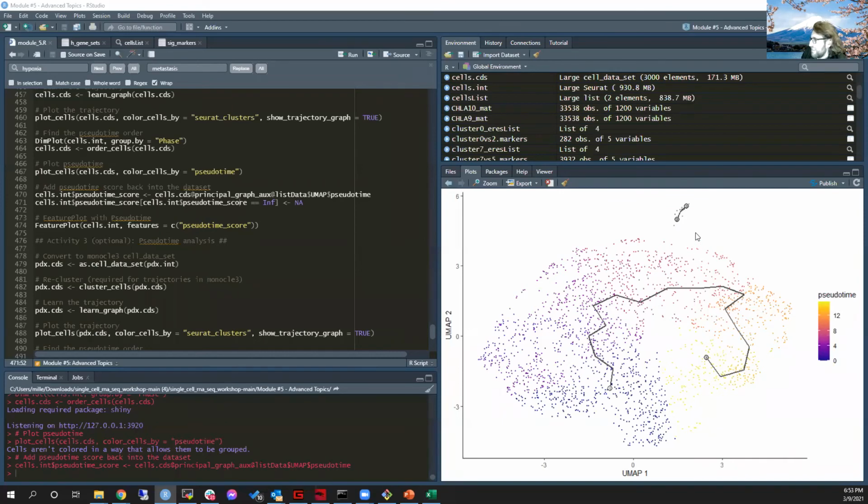These cells over here are not part of our graph network. Recall that sometimes you can have disconnected components of the graph. No matter how long we walk from this point, there is no way we can get here. There is no path that leads us here, which means that the pseudotime, the time it would take to walk here, is literally infinite because it's impossible to get here.